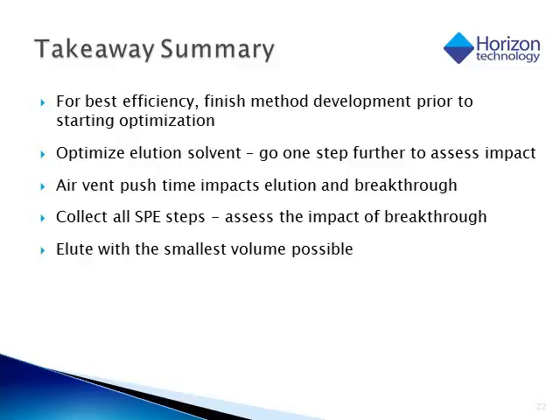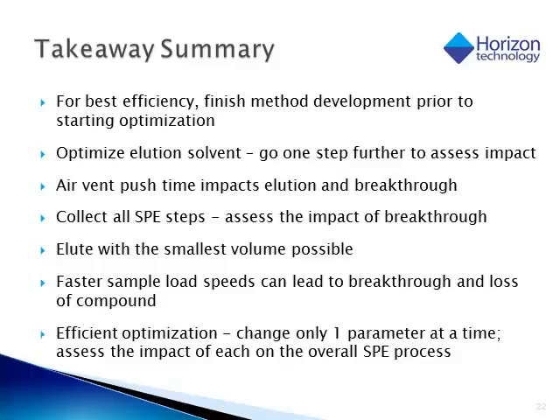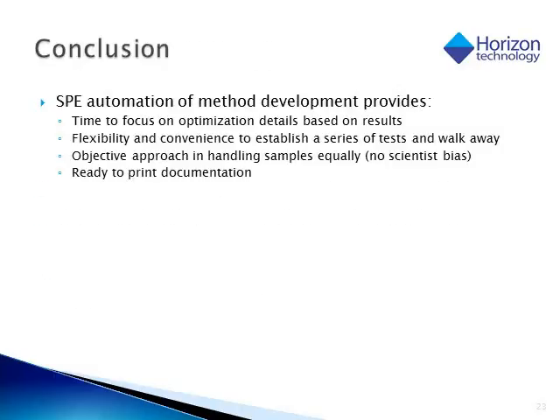Saving time on the back end following SPE can be done by eluting with the smallest volume possible. Speeding the SPE load, wash, and elution steps may lead to breakthrough and does not necessarily help with the SPE process if you're going to be having breakthrough of compounds, because that does lead to loss. And most of us already know this, but it's a good reminder: changing one parameter at a time allows for efficient optimization. You're able to take each of the parameters and assess the impact of it on the overall SPE process.